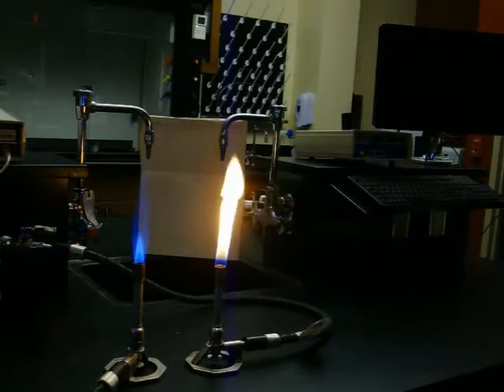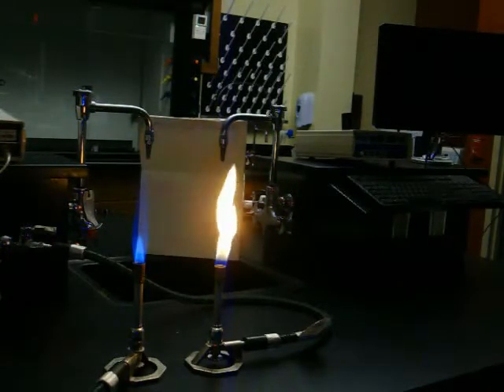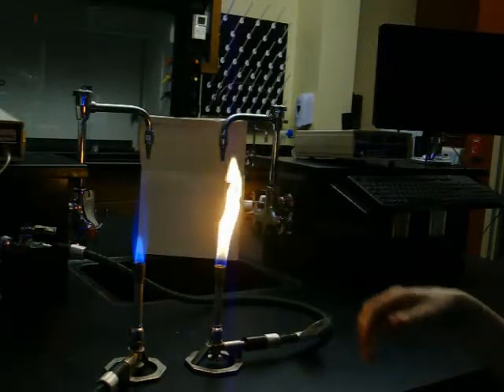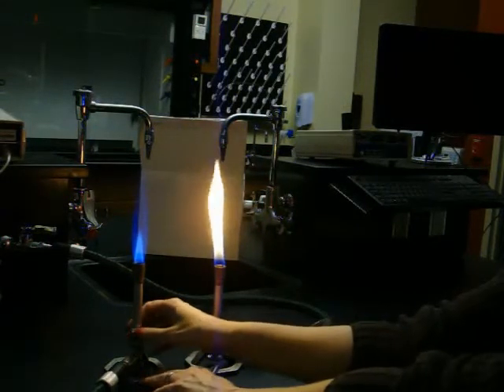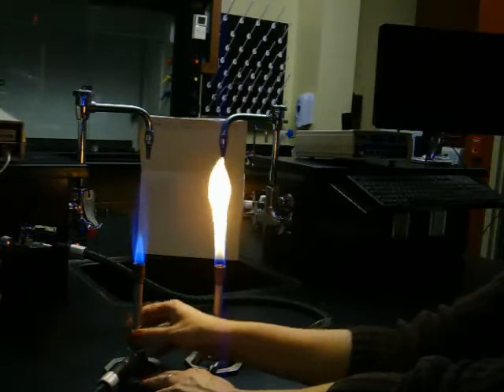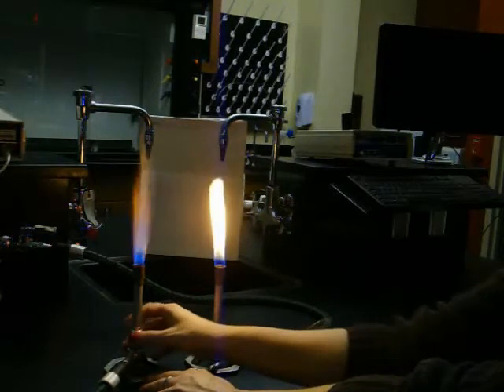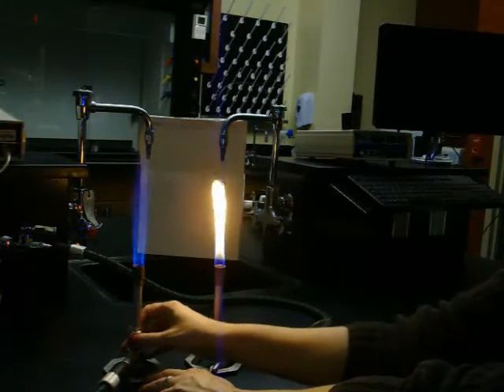A cold flame looks like a candle flame and is used to heat surfaces or substances gently. It is set by reducing the amount of oxygen proportionally to the amount of gas. Therefore, the air holes are either slightly opened or completely shut.